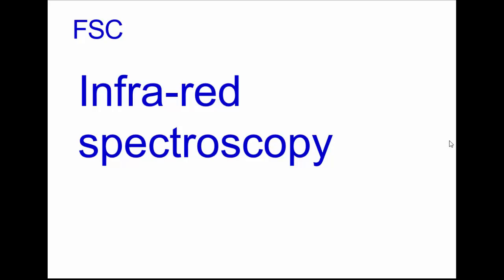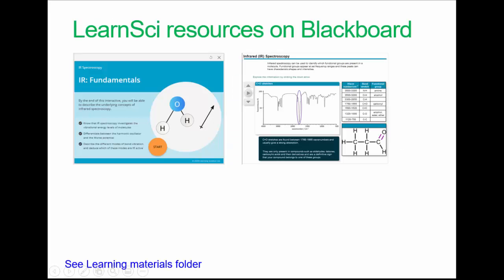Right, we're back for a short encore on infrared spectroscopy and Raman and handheld devices. Again, there's some good Learn Sci resources linked in Blackboard, and you should look at these in your own time. Some good stuff in infrared.